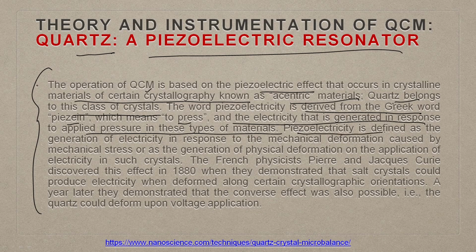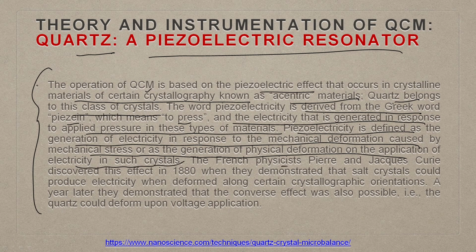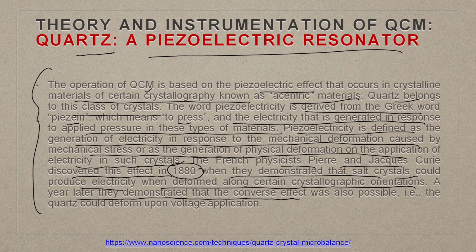So, piezoelectricity is defined as the generation of electricity in response to mechanical deformation caused by mechanical stress, or as the generation of physical deformation on the application of electricity in such a crystal. The French physicists Pierre and Jacques Curie discovered this effect in 1880 when they demonstrated that salt crystals could produce electricity when deformed along certain crystallographic orientations. A year later, they demonstrated that the converse effect was also possible, that is, a quartz could deform upon voltage application. This is exactly what I was trying to tell you in the first slide.